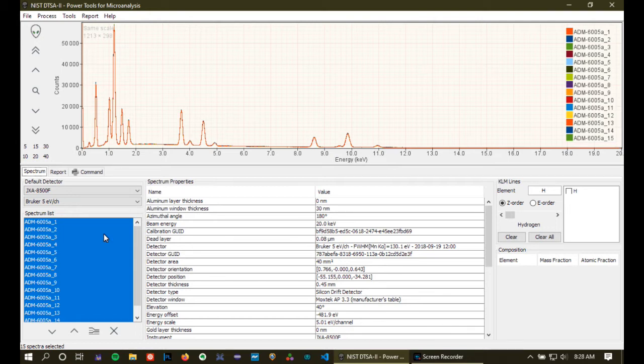What this allows you to do is actually compare the spectra and determine which ones are most similar to the rest and use those to build your bundle. Anyway, today we have actually 15 so we'll work with that.